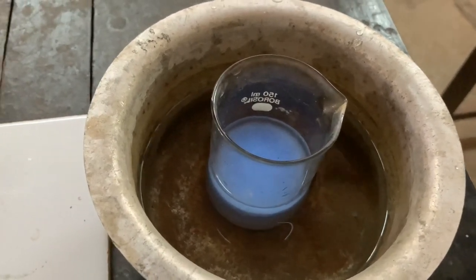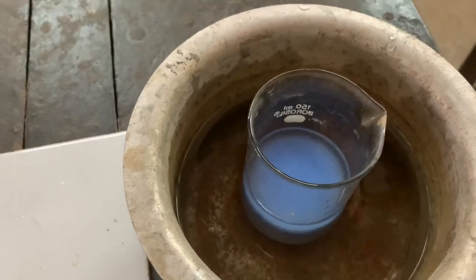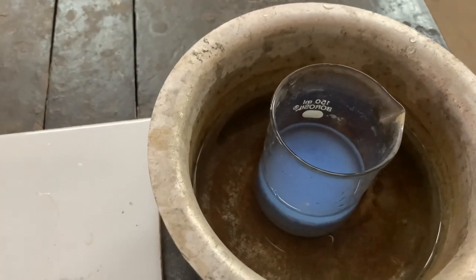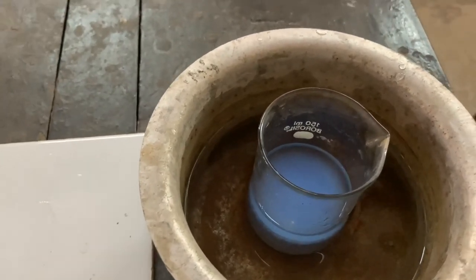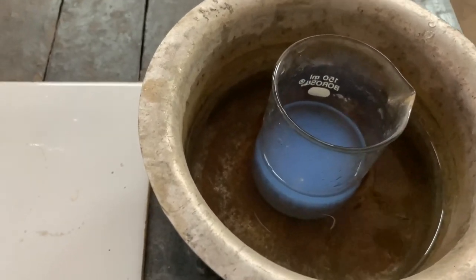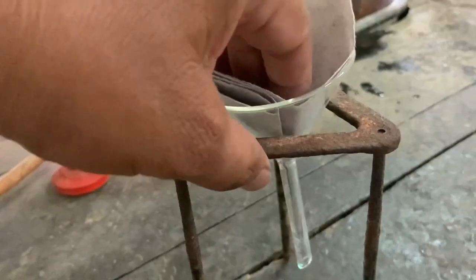Our complex is almost synthesized. We'll keep it for about 15 minutes in the water bath so the precipitate of nickel hexamine sulfate separates out and settles down. Then later we'll filter it. We'll set up a filter paper here for filtration purpose.